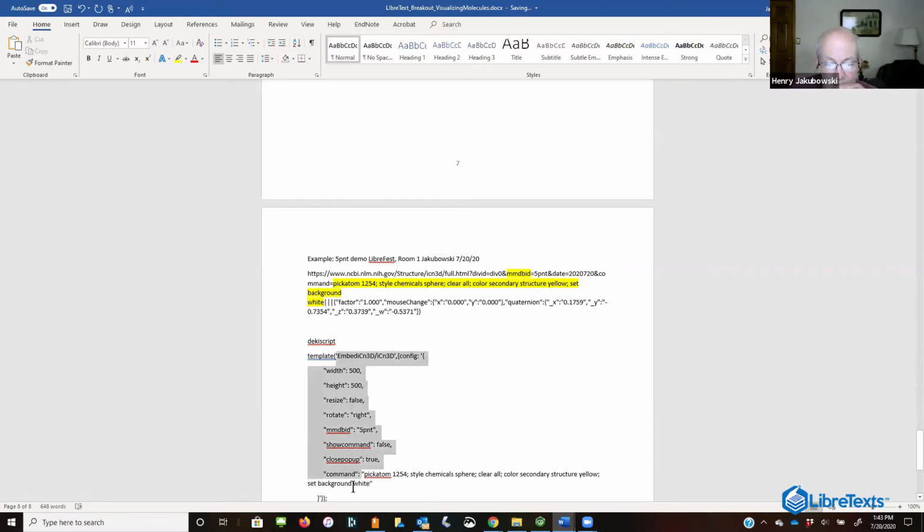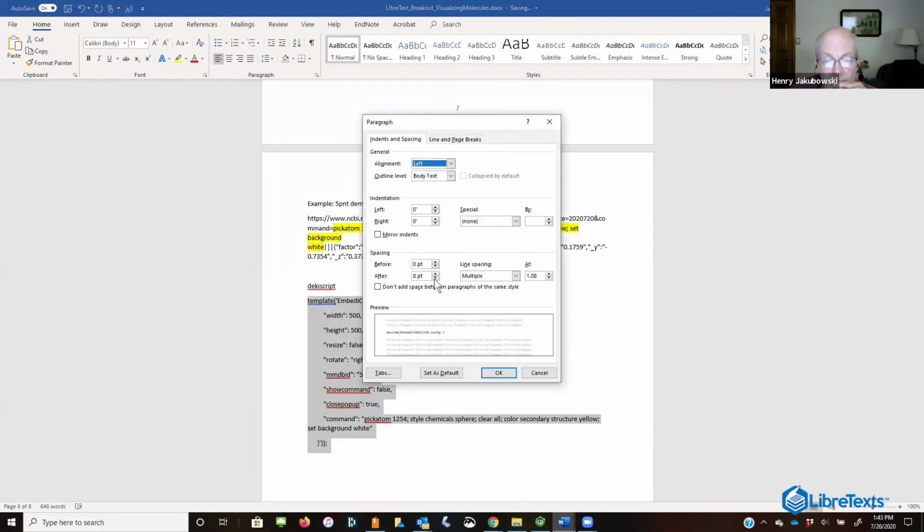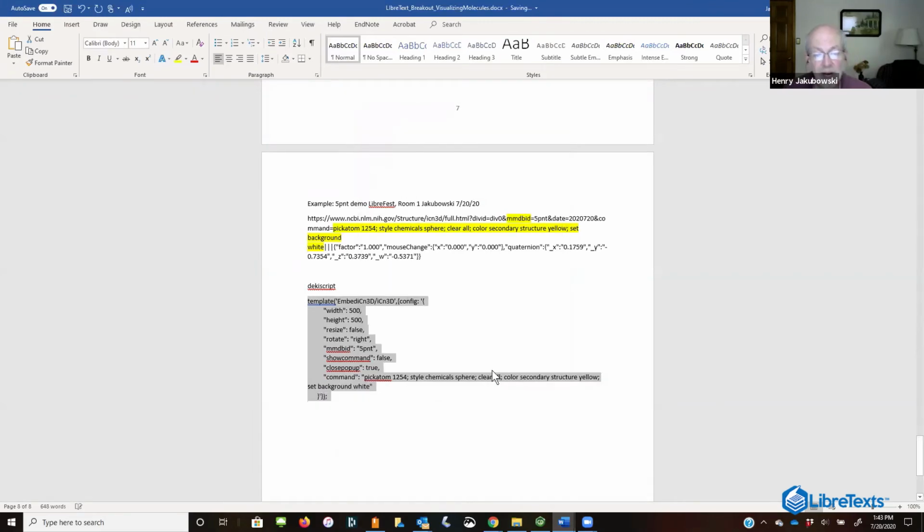And I could put command in quotes, and then I could just put empty quotes after that, probably, right? Yeah. I'm going to get rid of the spaces here too. And like I said, if you just do this, it's so easy. Now, that's not to say I don't run into problems sometimes, especially when I try to get really sophisticated. When I think of what people would like to do, I have a ligand bound. You would like to see what's 5 angstroms around it and the interactions. And I can show you what that looks like. I mean, it's so simple to do.